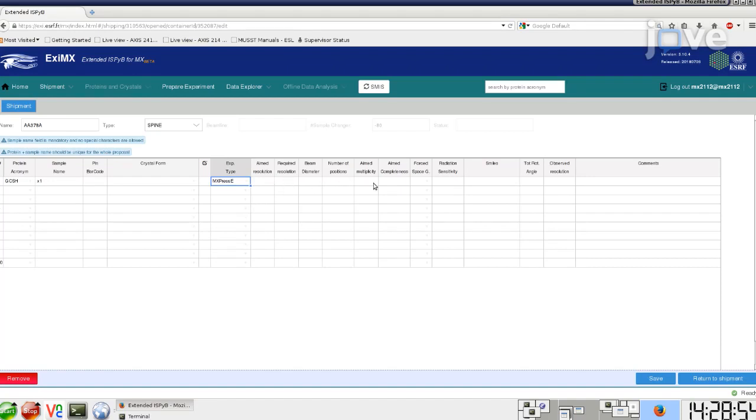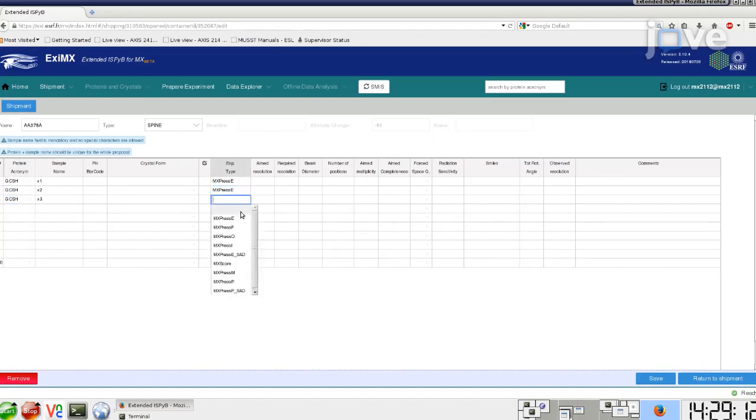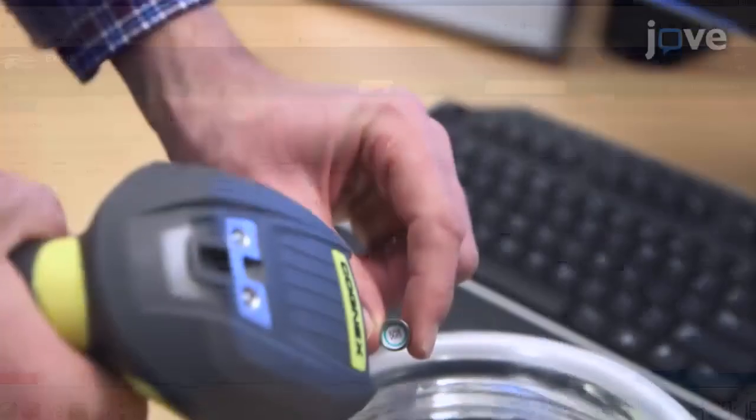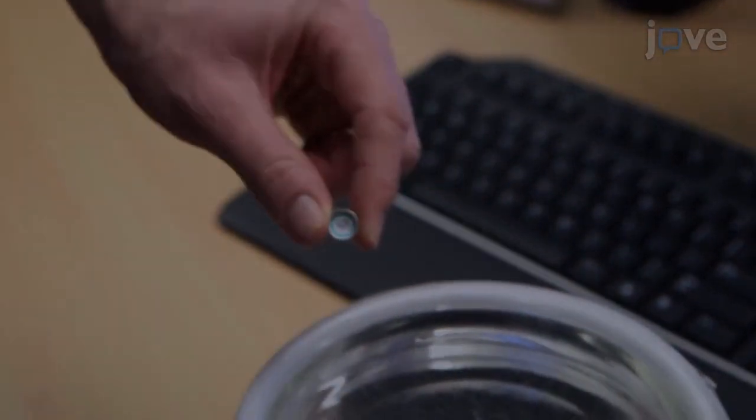Choose the protein that has been approved by the ESRF Safety Group. Enter a unique sample name to identify each individual sample. Optionally, scan the pin barcode.